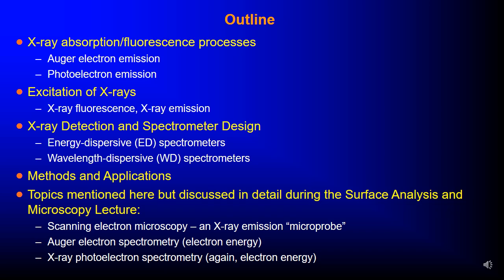So methods and applications are topics mentioned here but discussed in detail during the surface analysis and microscopy lecture. We look just briefly at scanning electron microscopy, Auger electron spectroscopy, and X-ray photoelectron spectroscopy.